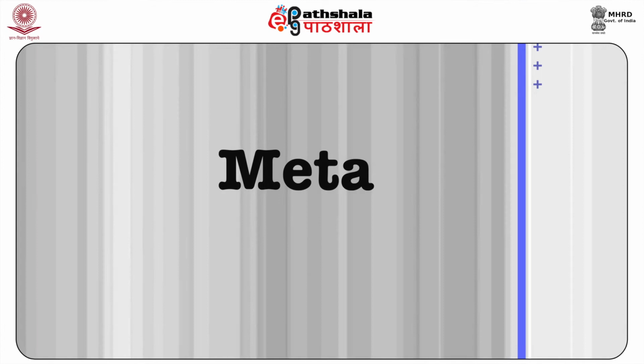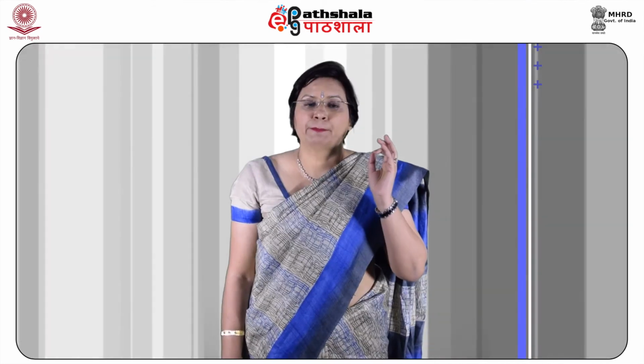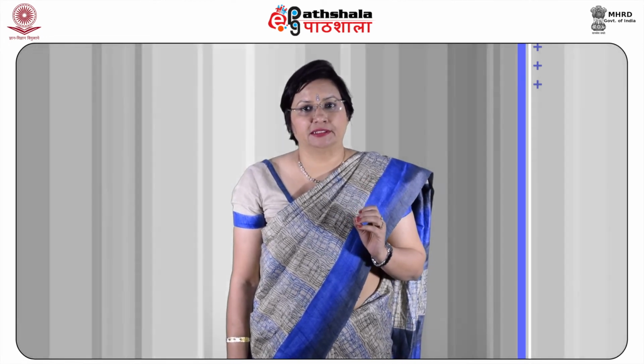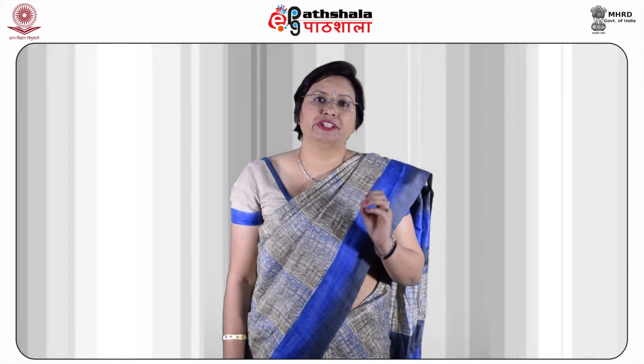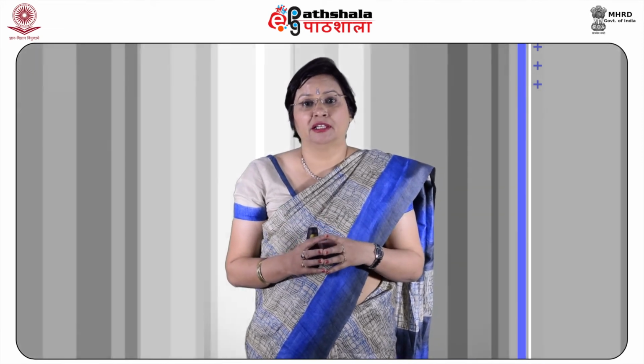After the hardness and alkalinity, let us move to metals. The presence of metals in water is a subject of serious concern because of the toxic nature of many metals. Some metals are good, but many are harmful at times.